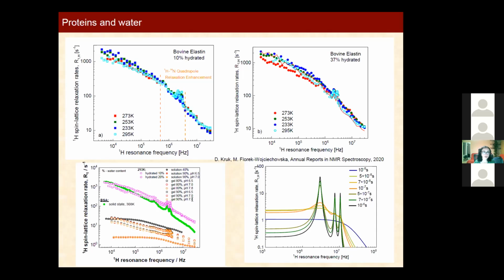You can create some gels. Eventually, you can measure relaxation data for highly diluted compounds, when definitely then you get signal from water. You can go through all that and see how this evolves. Actually, one should be very careful, in my opinion, because I just do not think that the relaxation will be exponential.